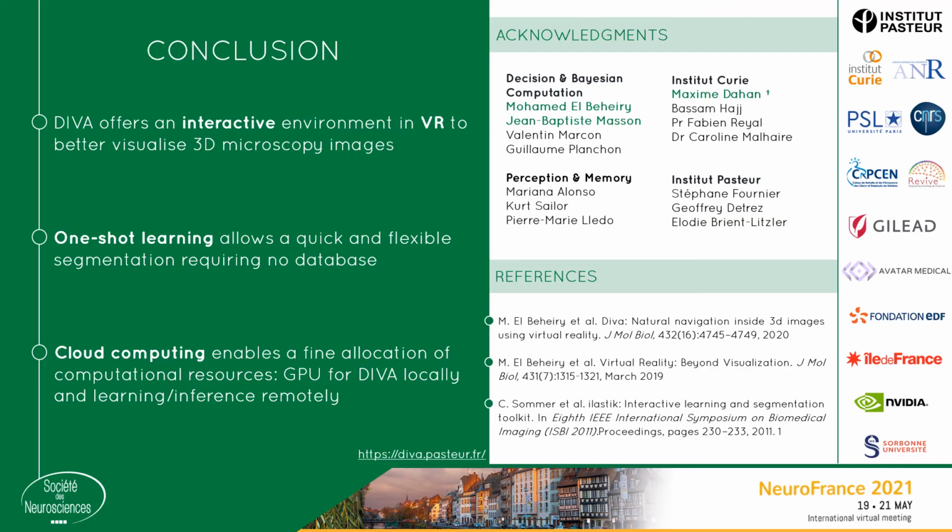To conclude, DIVA offers an interactive environment in VR in order to better visualize 3D microscopy images. In addition, the one-shot learning allows a quick and flexible segmentation without a database. Finally, cloud computing enables a fine allocation of computational resources. You can find DIVA on the website diva.pasteur.fr.